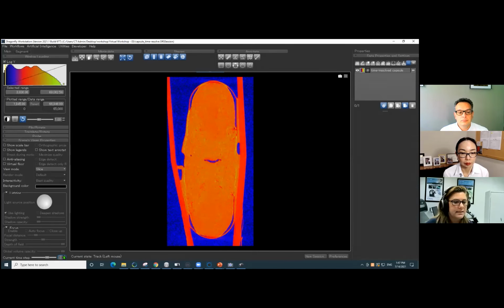We can go to the next time point, and we see now this is changing in color, and all of the interior components that are in this section are now starting to dissolve as well. And again, not much difference in change. And then finally here, we see lots of cracks and things happening throughout the pill.